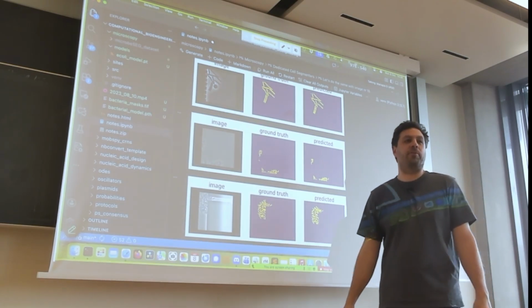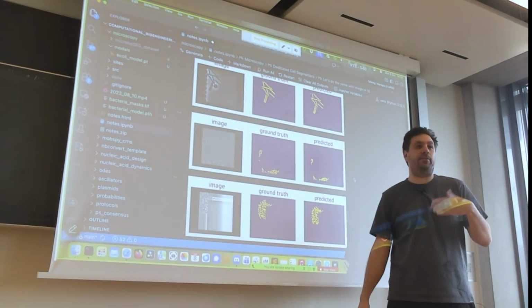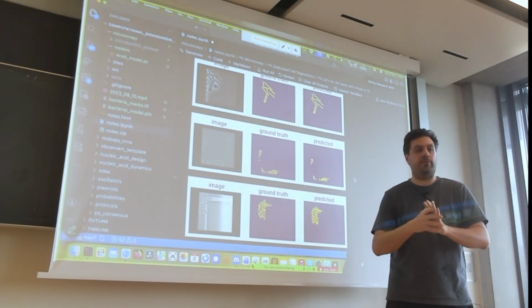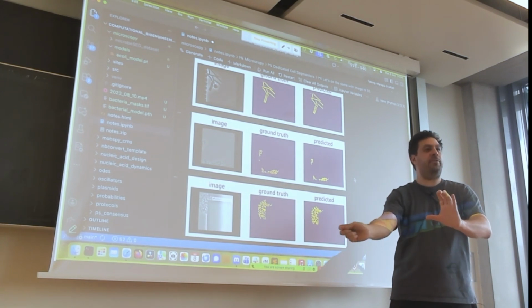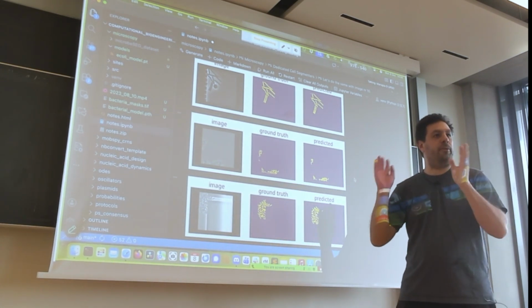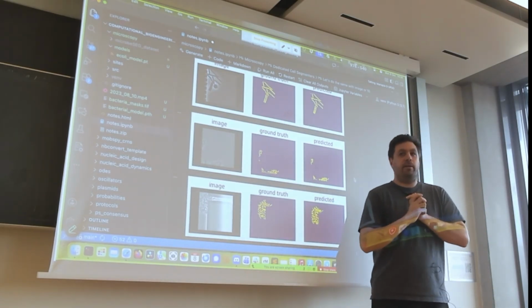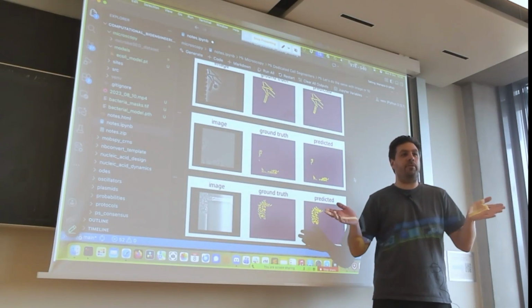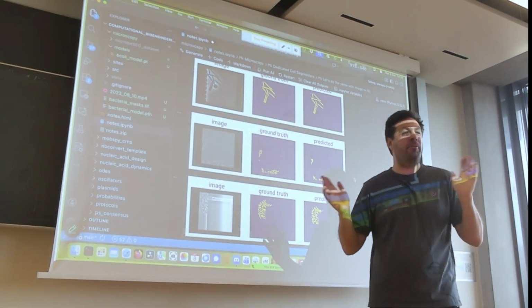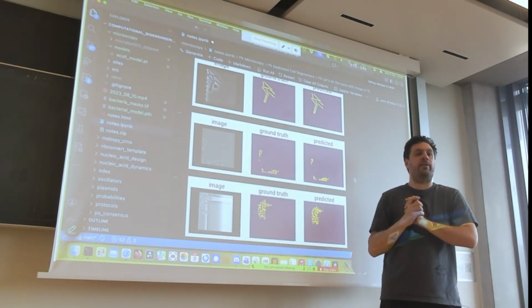Yeah. This is what I mentioned, it's done with a 40x microscope. And it's a super simple setup. Like, to take this image, it was 5 minutes. You put the slide under, you snapshot, and that's it. You can do much better with an oil immersion microscope and so on, but this was not the purpose. We wanted something with a super simple setup, like a Raspberry Pi camera, which costs maybe 20 euros. The Raspberry Pi costs perhaps 100 euros. Put it together in 5 minutes and make a picture.